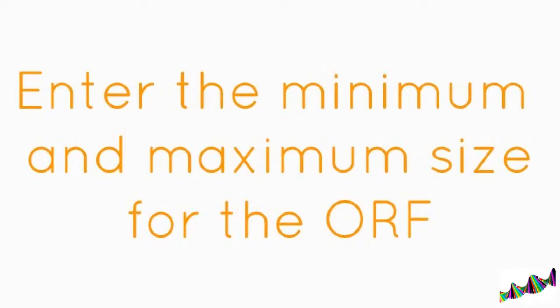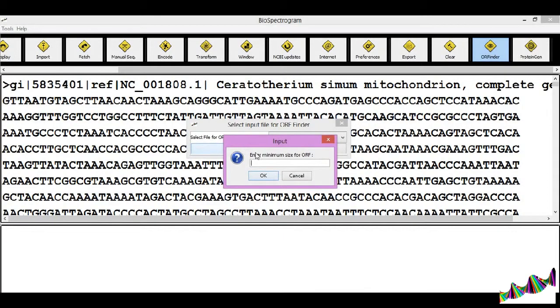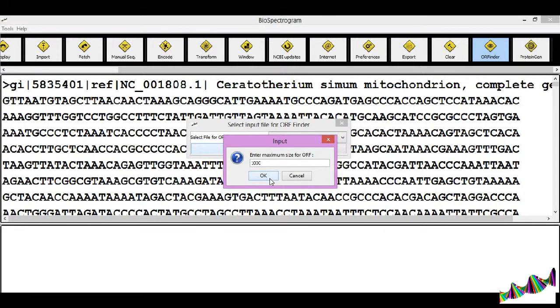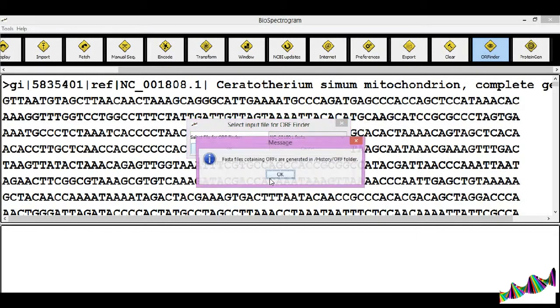Enter the minimum and maximum size for the ORF. In this case, 3 is set as the minimum size and 1000 as the maximum size of the ORF.